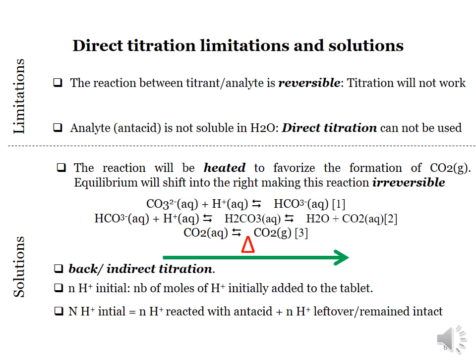This number of moles initial of acid is equal to the number of moles of acid that reacted with the antacid, plus the number of moles of acid that are left over, remained intact.